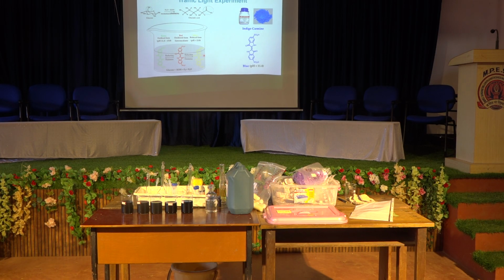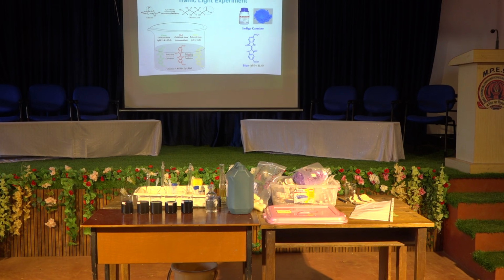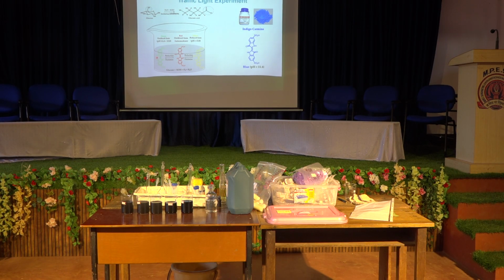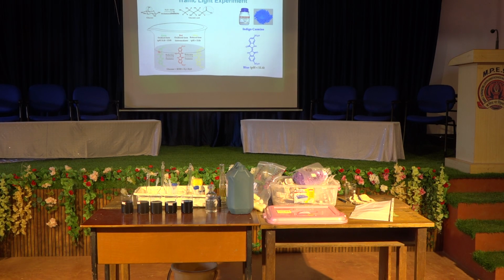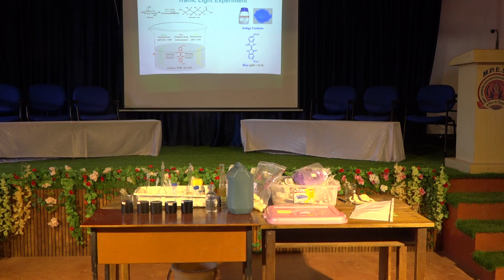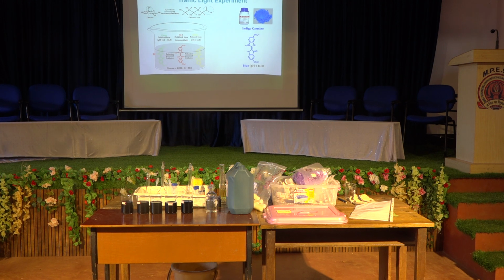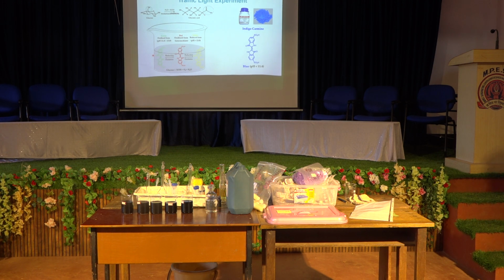When you shake it, it reacts with oxygen. Oxidation happens. First, one group will oxidize the alcohol to ketone. That means yellow to red. Then the next one will oxidize. If you keep shaking, both ketonic groups will appear again. That's green. And leave it, again reduction. You can go back and forth. That's it. So with this dye, if you have a dye with multiple functional groups, you can have multiple colors too.